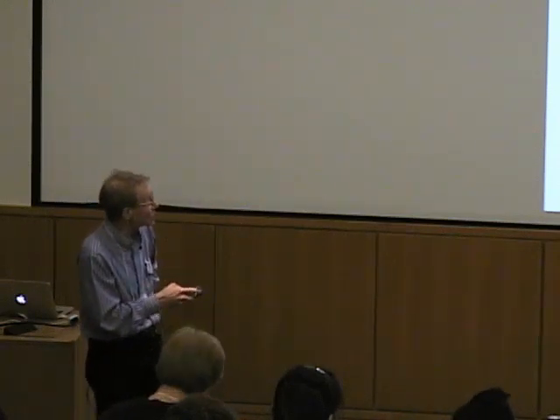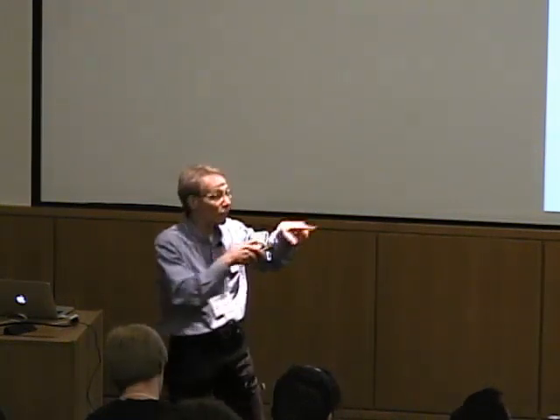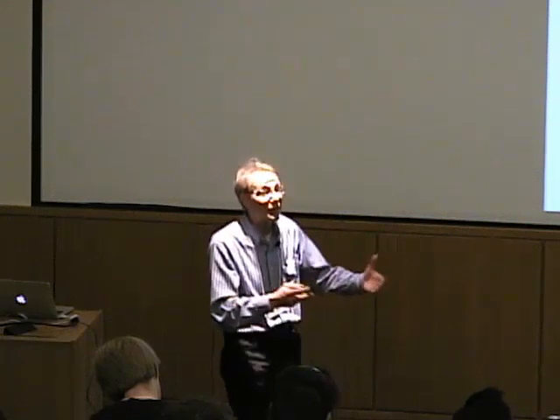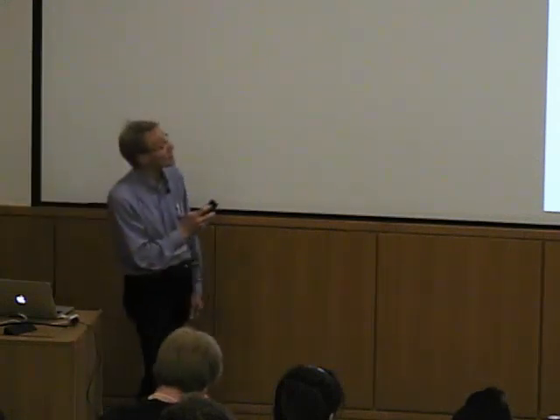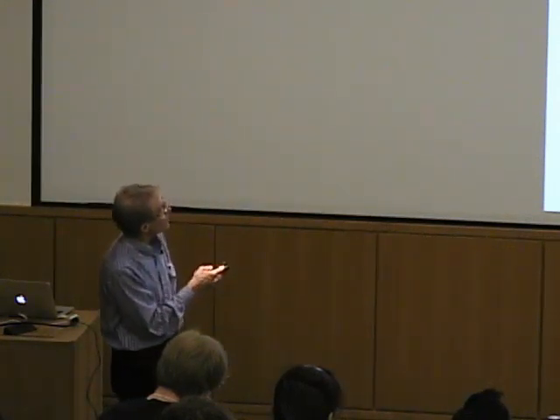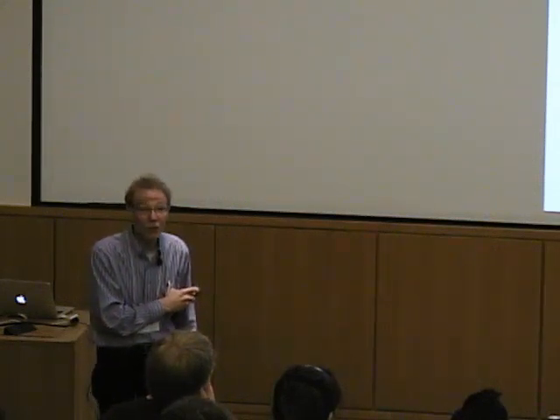We do a proton inventory here. We come up with a prediction of 0.9 protons going to the buffer. We measure 0.3. So there's a bit of a disconnect here in terms of one experimental measurement from calorimetry, another predicted from experimental pKa's. Still wrestling with that question, but here's an area where different methods should be converging on the same analysis. Okay, copper-1 binding to azurin, different buffers, log K, about 2 orders of magnitude higher than copper-2.